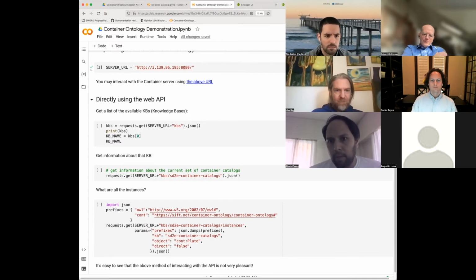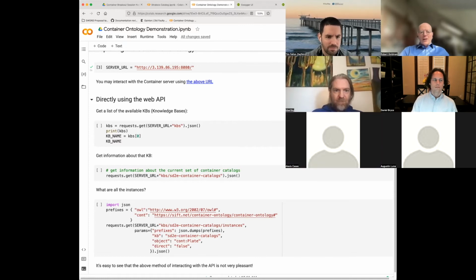All they want is access directly to something so that they can use that in a protocol directly. I think it would be worth keeping that for the discussion later of how to put that in place. Yeah, I think that's something we should just do in the PAML meetings, because it's just a matter of figuring out how to maintain it, and that's not a problem.